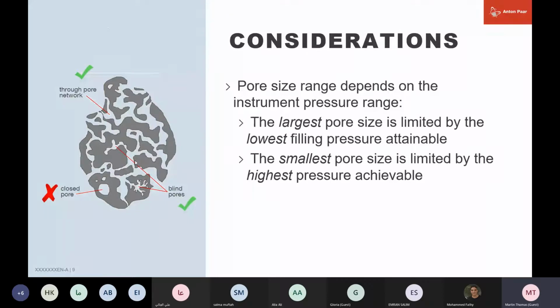So when the mathematical modeling is done, where do you start? Oftentimes you start with the mercury porosimetry pore throat distribution, in order to calculate not only what the reservoir volume is, but how the oil is going to get out. The oil is going to get out of the rock, or be displaced out of the rock, by basically backtracking the route that the mercury took to get in. This is why it's so important to make these measurements to understand reservoir rock.